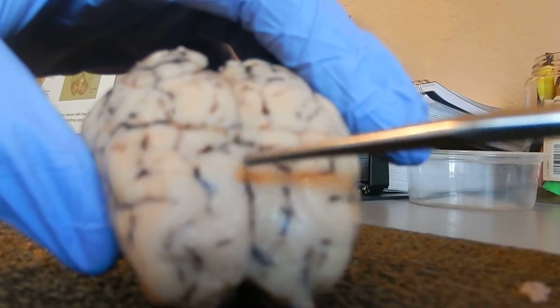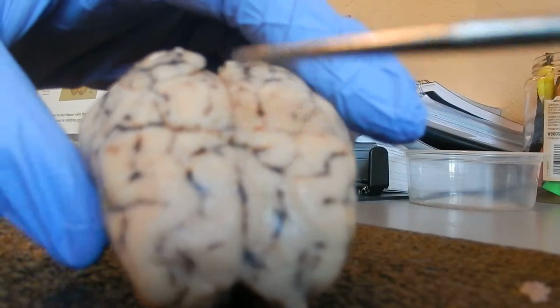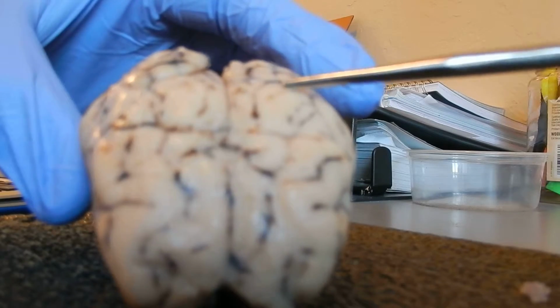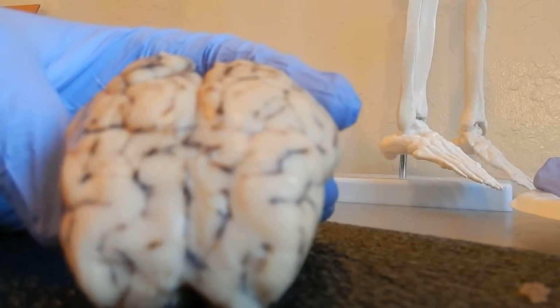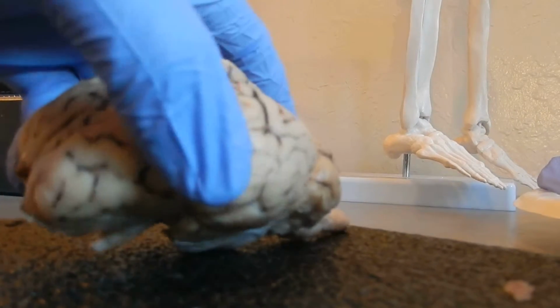Then we have the longitudinal fissure here. You have the cerebral hemispheres here. You have left and right cerebral hemispheres. And you have your lateral sulcus.